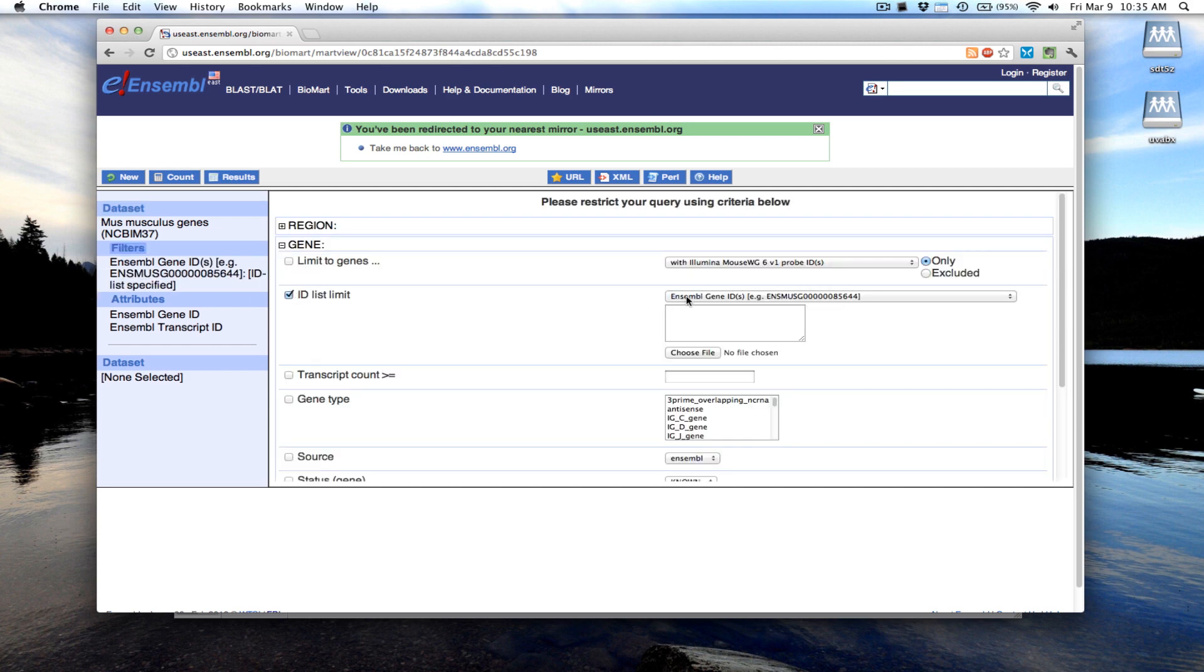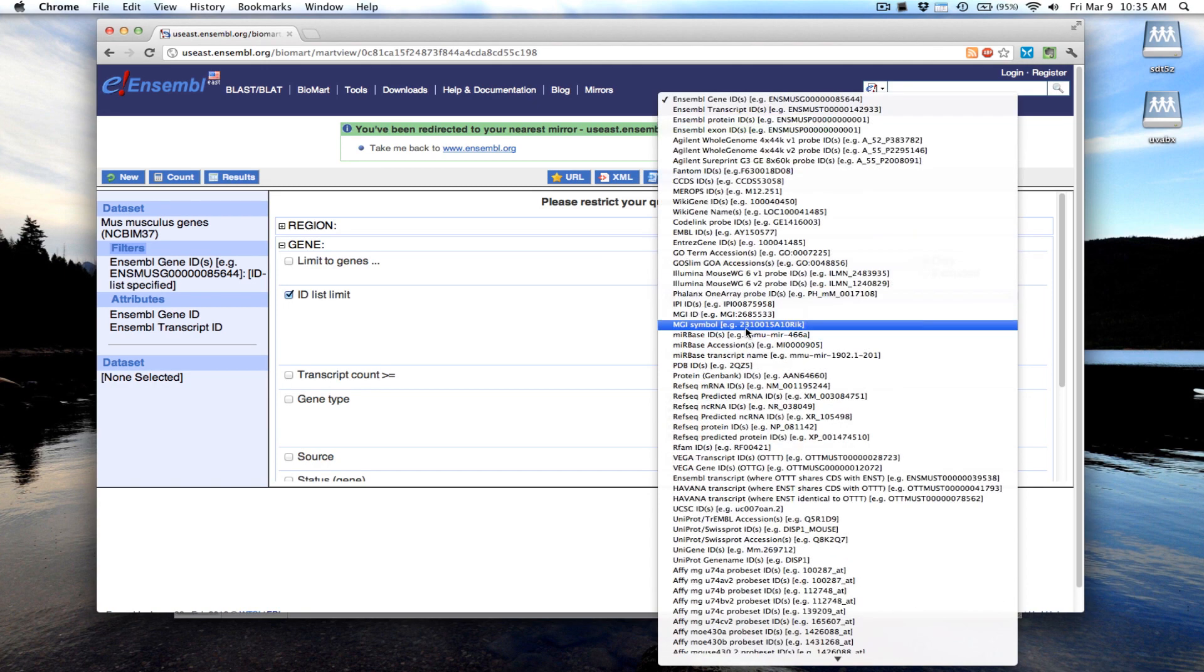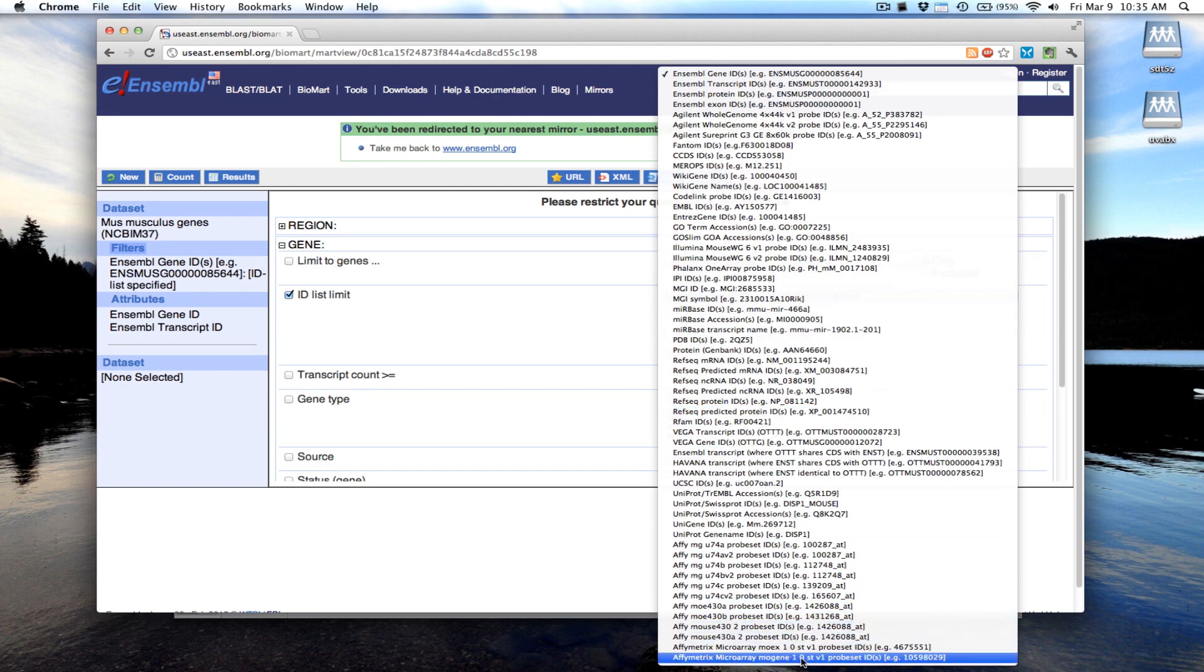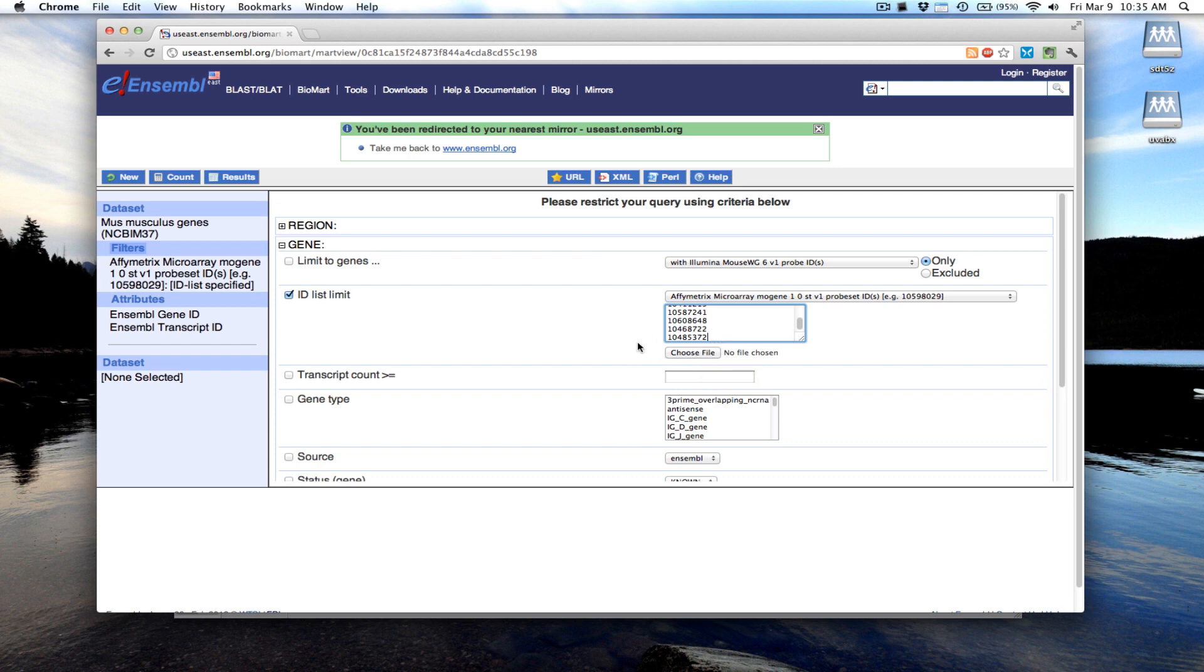The type of gene ID that we're going to use is all the way down at the bottom: the Affymetrix mouse gene 1.0 ST array probe set IDs. We paste that list of gene IDs here. You could also upload a text file with all these identifiers if you have more than you want to copy and paste. Now we need to select which attributes we want to display.